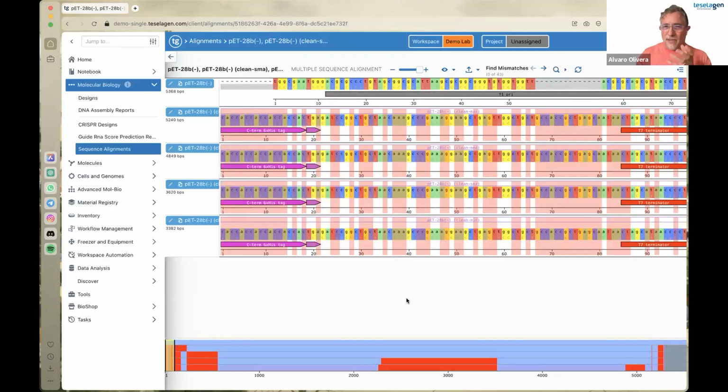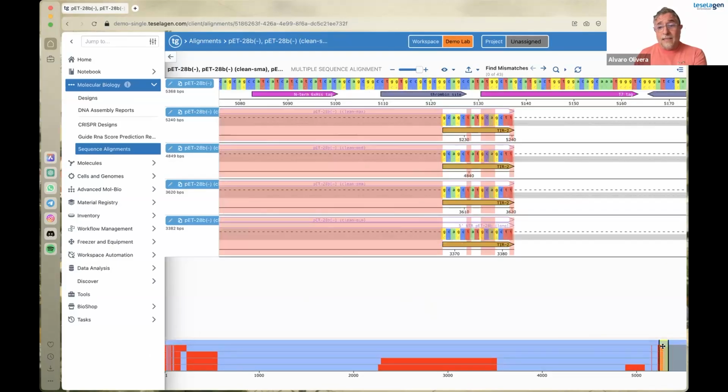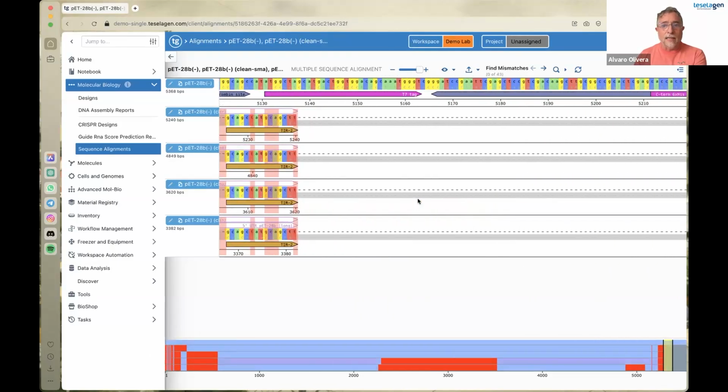So I know that something is not very good in the alignment because I would like this C-term 6-his tag of all the vectors aligned with the one on top. Since these are circular sequences, it's a little difficult. What can I do if I have something like this?